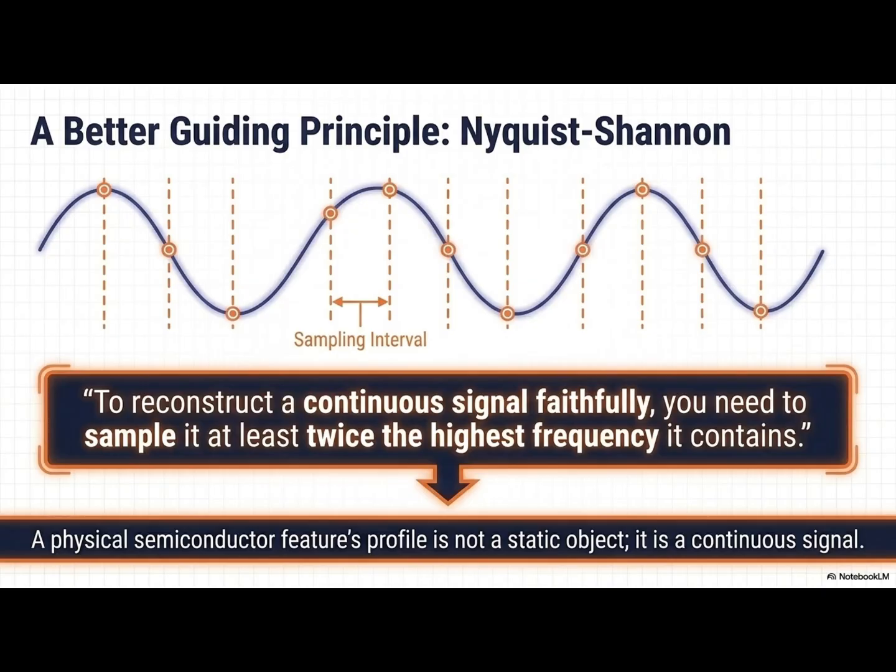They're measuring relative alignment. Advanced algorithms, clever target design, and signal processing allow them to sidestep the apparent physical resolution limits. This is a good reminder. SEM isn't a feature measuring machine either. It's really an edge detector, counting the distance from one detected edge to another. That difference in perspective changes the rules of the game.